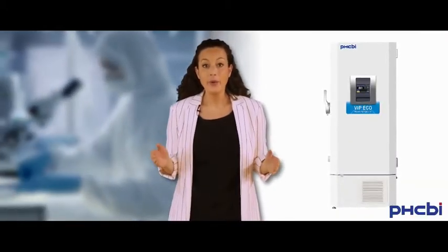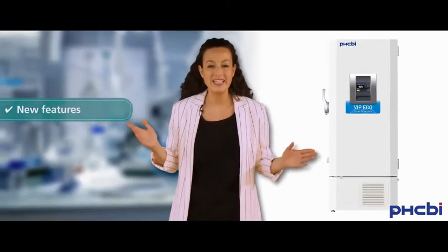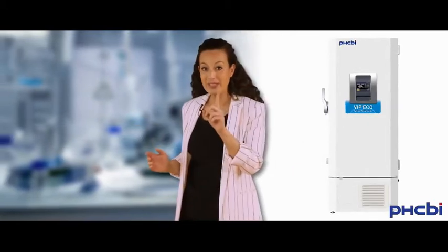We've done more than just restyled the exterior, because now we've included a number of new features that will improve this new version for many years to come. Let me sum it up for you.